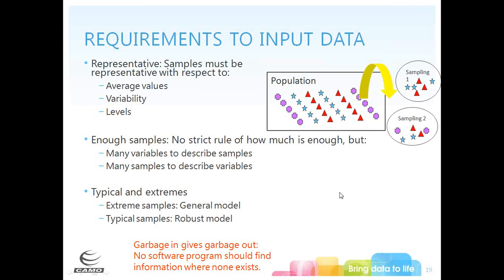Regardless of our objectives, it's important that we properly select data and collect samples to collect those data, because the important thing is garbage in gives garbage out. No software program should find information where none exists.